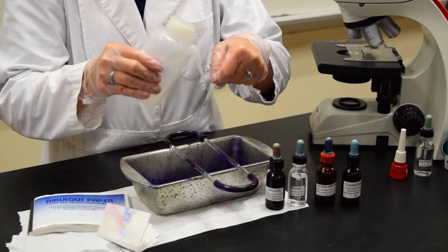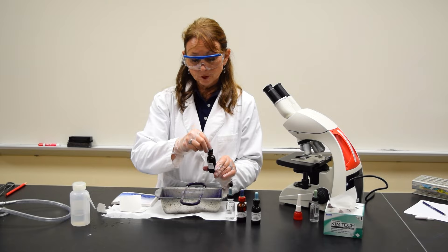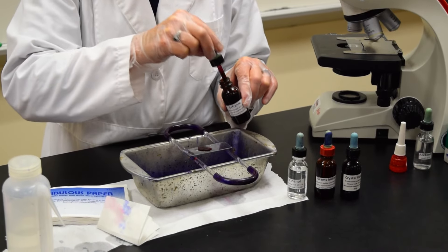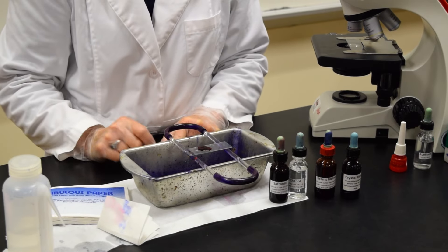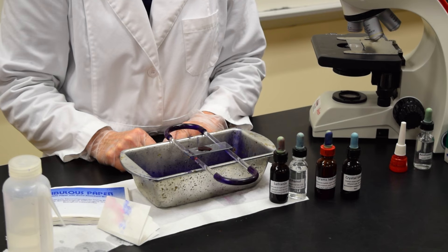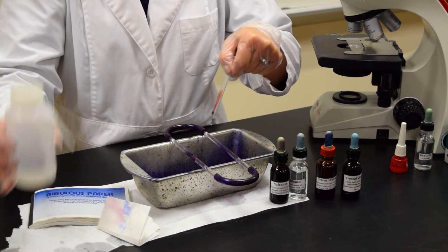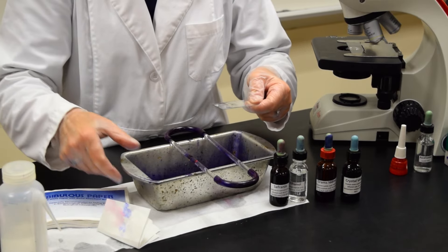Rinse with water. Then the fourth and final reagent: add several drops of the safranin red dye to the smear and allow it to stay on the slide for 30 seconds. After 30 seconds, tilt the slide over the tray and rinse with deionized water.